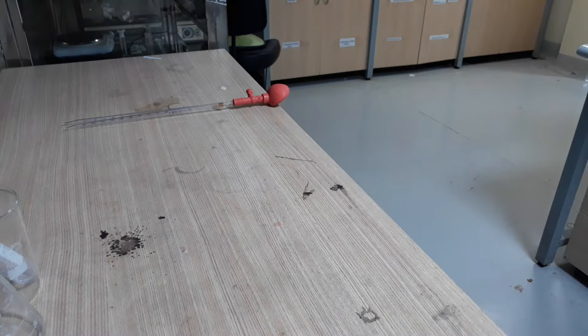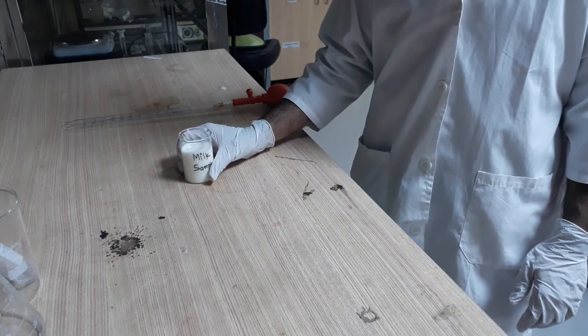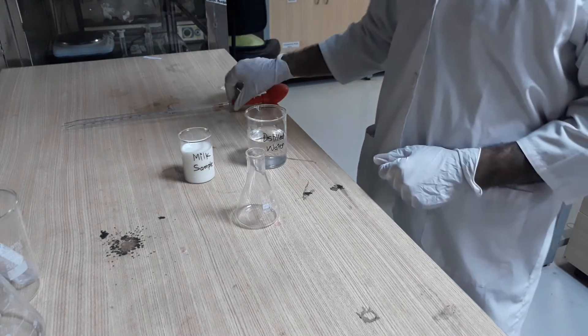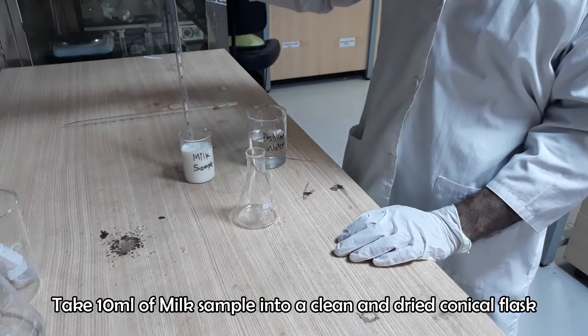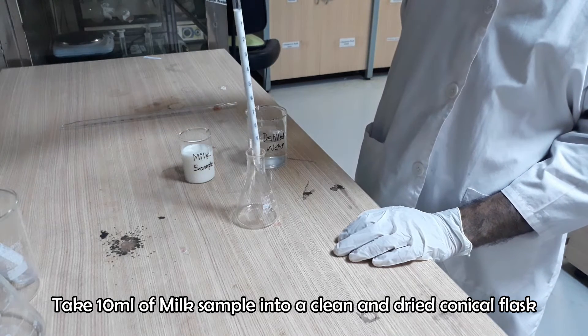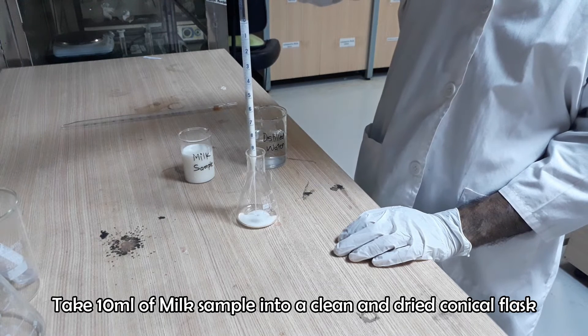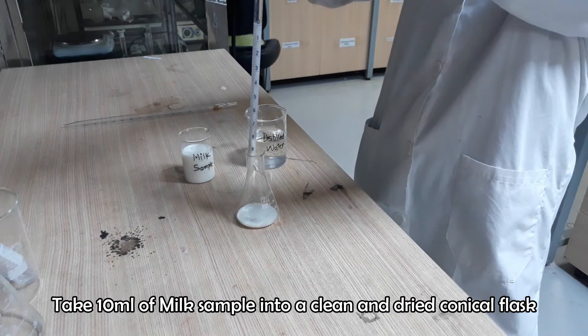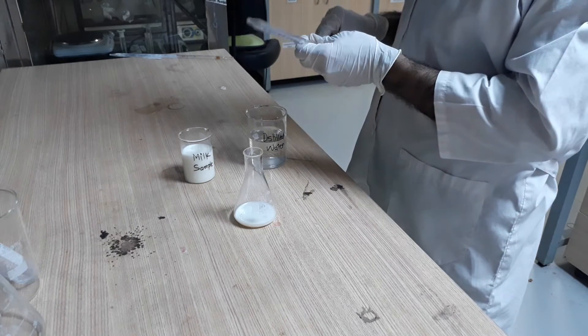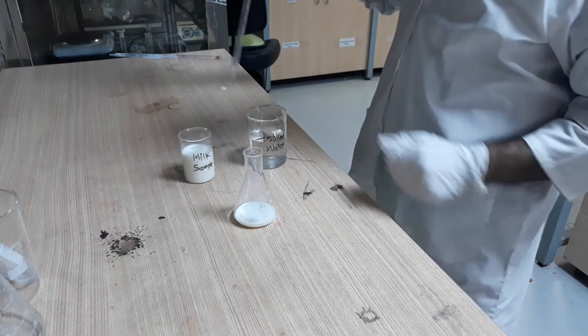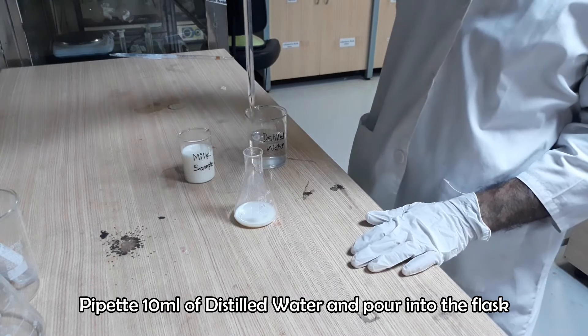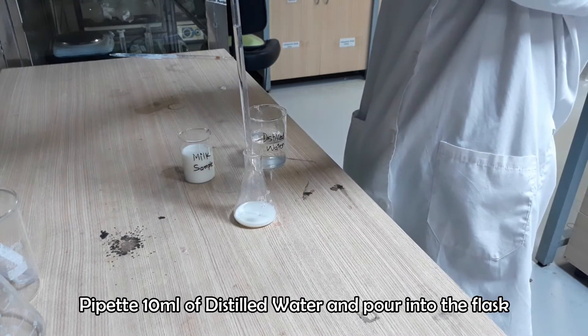Now we have to prepare our sample. Take 10 ml of milk sample in a conical flask. Add distilled water into the flask and shake it to mix the sample with water properly.